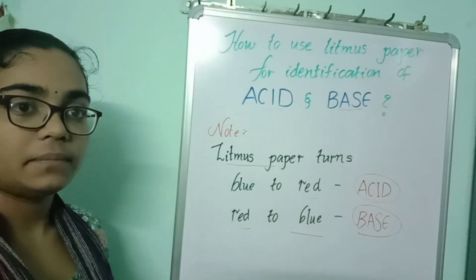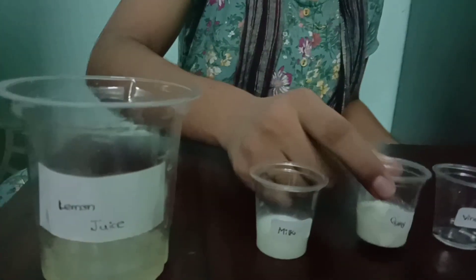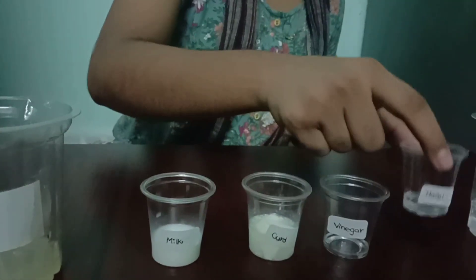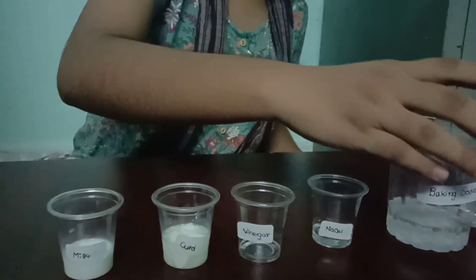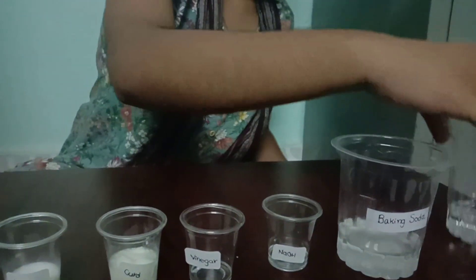So let us do the experiment. The materials I am using are some lemon juice, milk, curd, vinegar, NaOH — sodium hydroxide — baking soda, and water. We also need litmus paper. This is blue litmus paper and this is red litmus paper. Now let us check one by one.